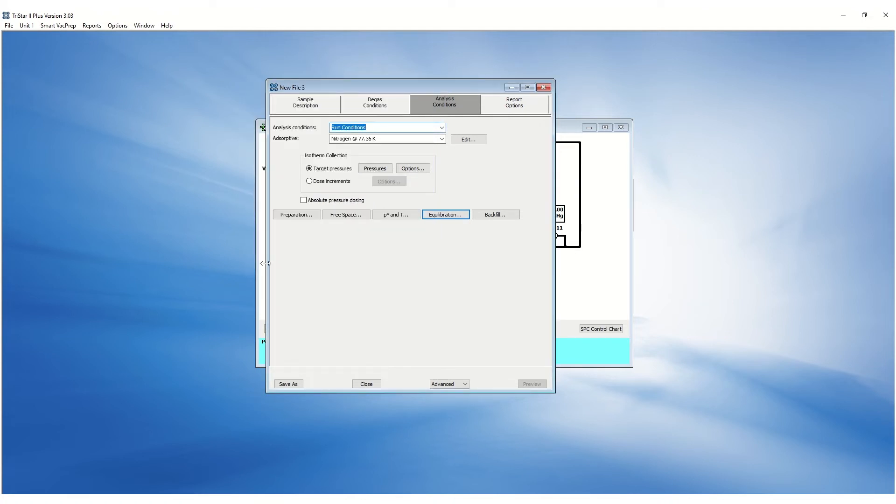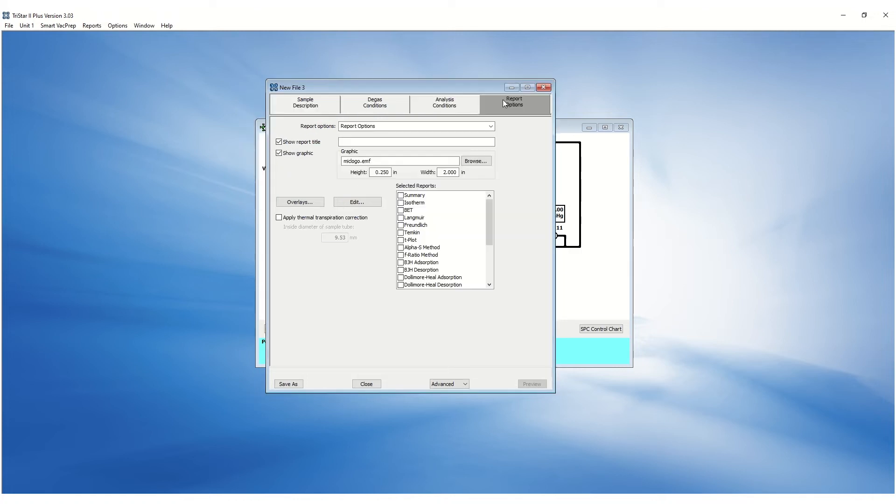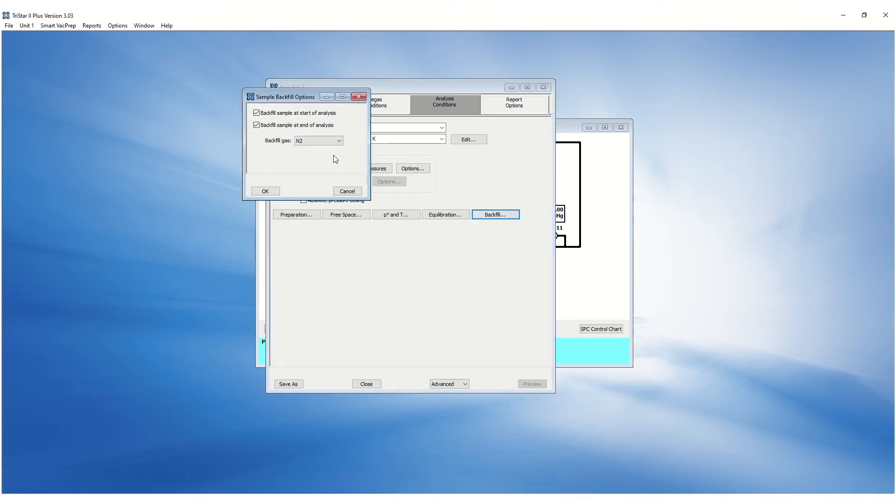Backfilling at the start of the analysis pressurizes the manifold to match the pressure of the sample tube before opening the valve. This prevents sample contamination in the manifold. Backfilling at the end of an analysis will pressurize the sample tube instead of potentially leaving it under partial vacuum.